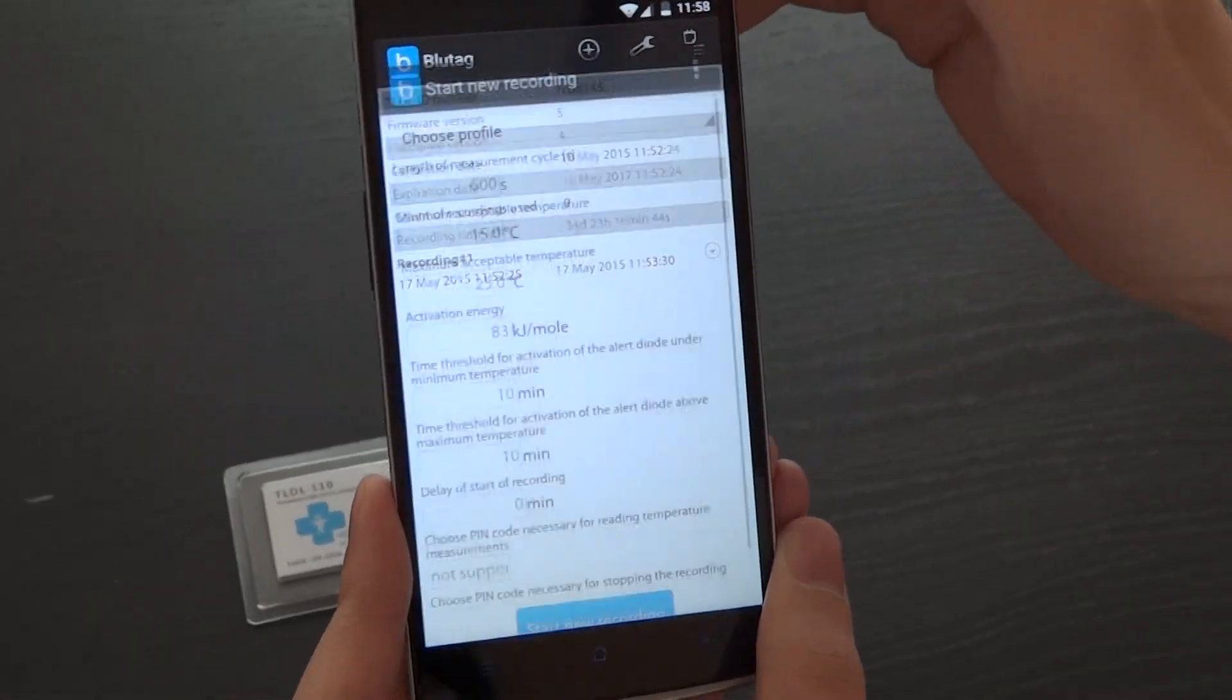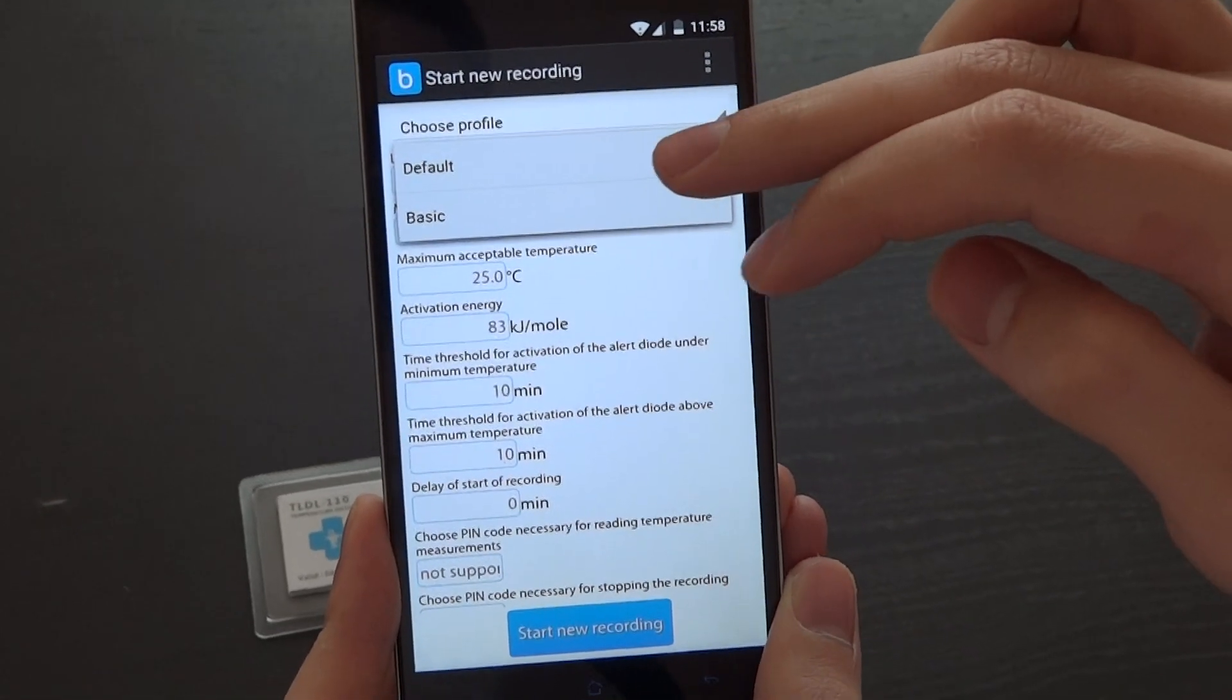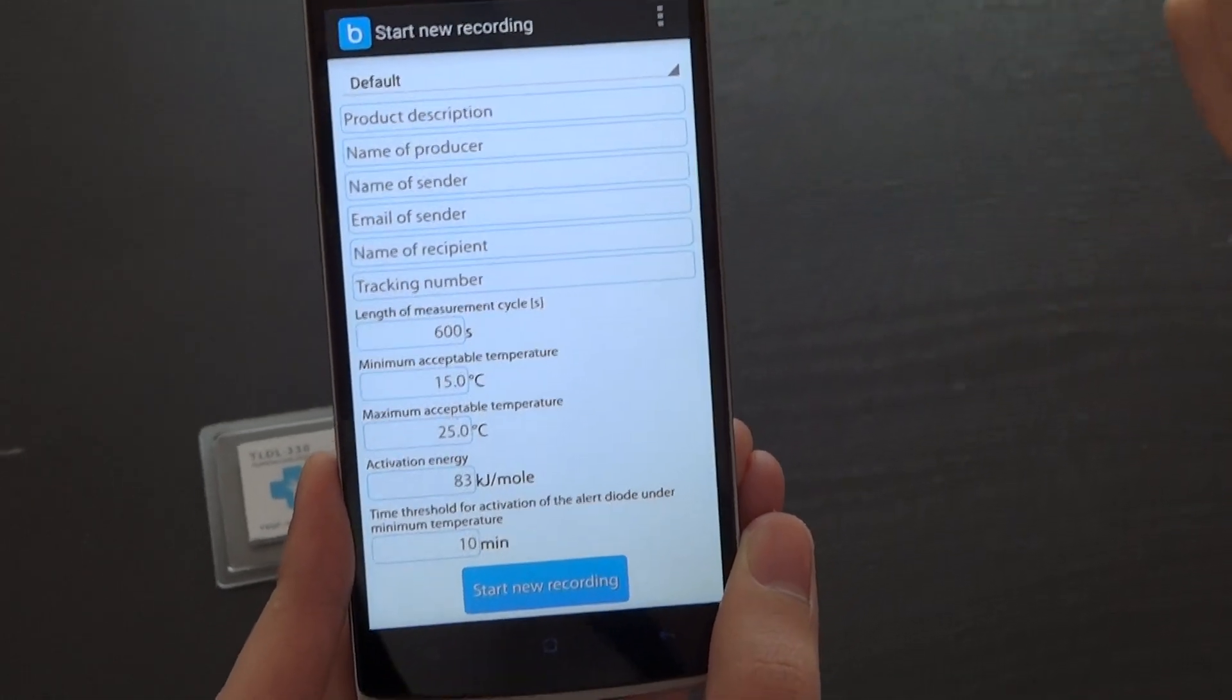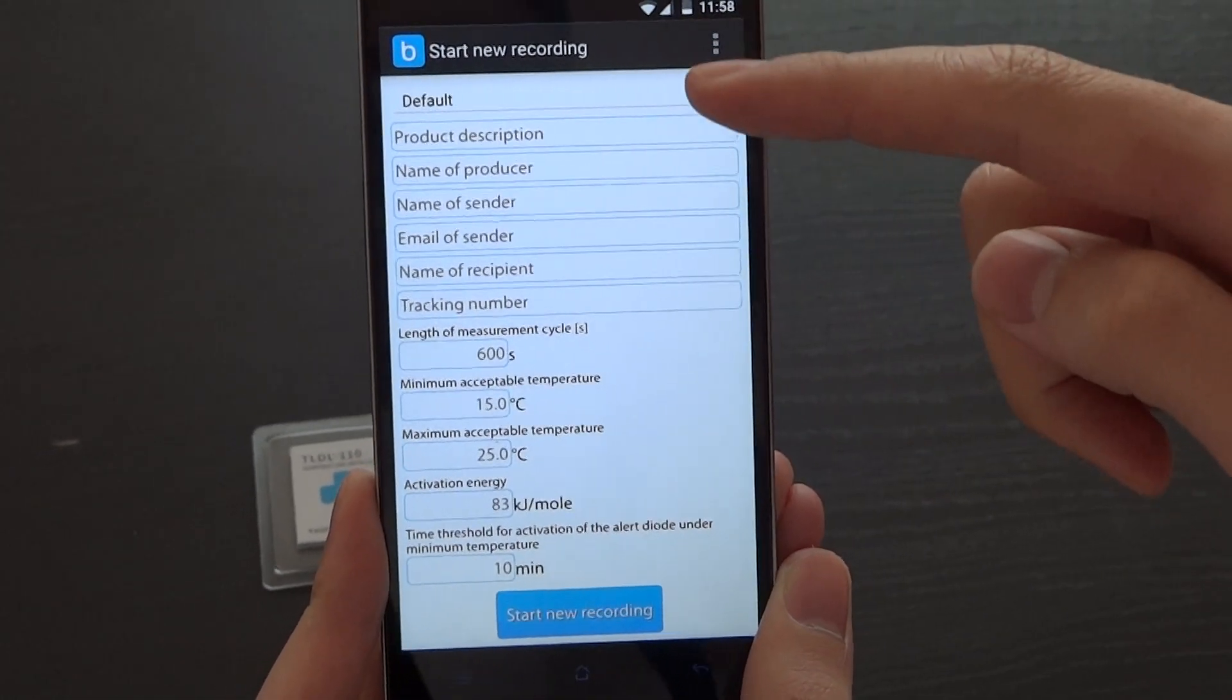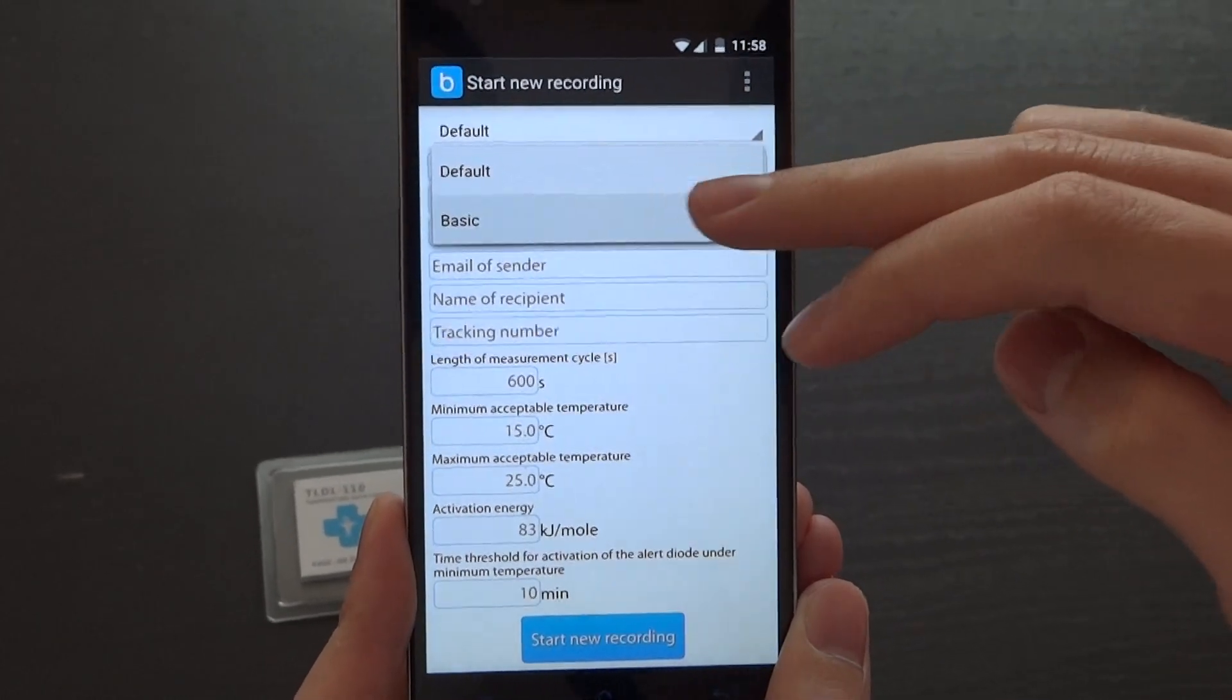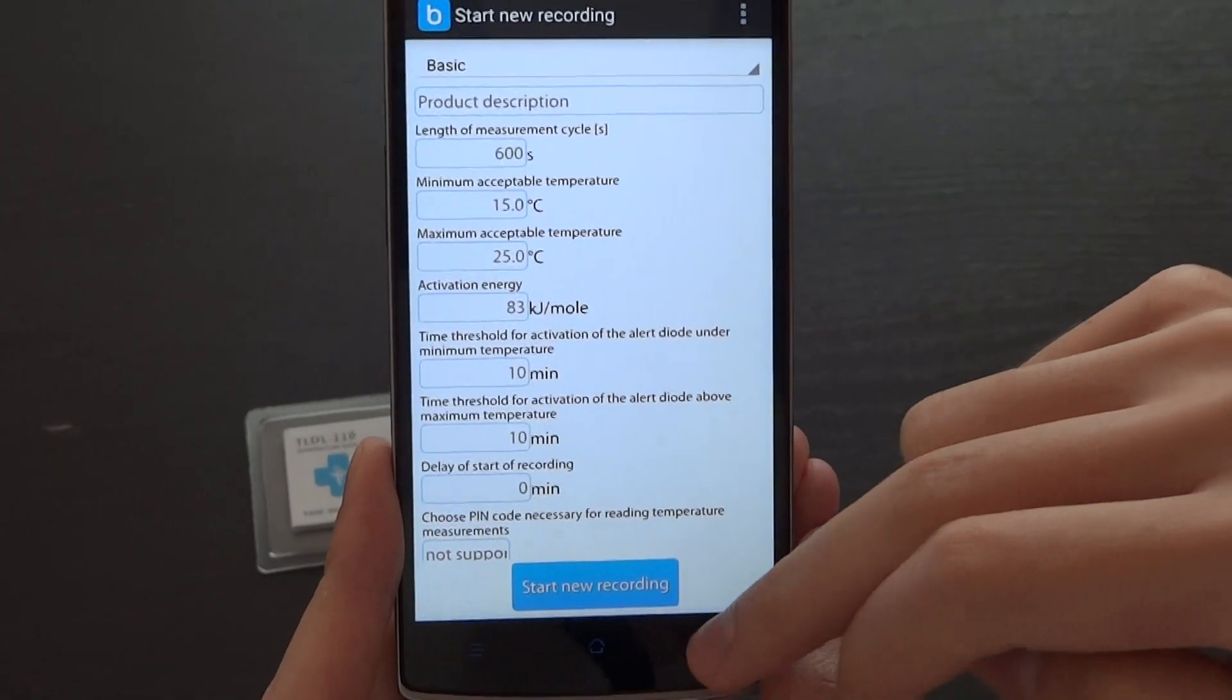To start a new recording, you first have to choose a profile. There are two profiles by default: the default profile which contains logistical information and the basic profile which just contains product description.